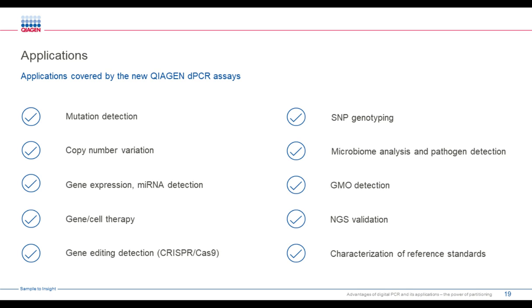When we talk about gene expression, this is actually not so straightforward, as with many things when it comes to digital PCR. Because normally in gene expression, you have cDNA, and cDNA you have very abundant, you have quite a lot of cDNA. That means that normally when you use the references that you have on a qPCR, they tend to saturate the whole system.